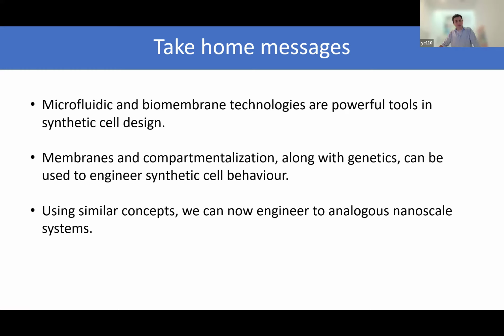Membranes and compartmentalization, along with genetics, can be used to engineer synthetic cell behavior, movement, stimuli response behaviors, and so on. And then using similar concepts, using tools and technologies and ideas and concepts that we've developed over the years for synthetic biology, applying them in a different but sort of related area of nanoparticle engineering and drug delivery, really allow us to do sort of different things that weren't previously possible on the nanoscale.